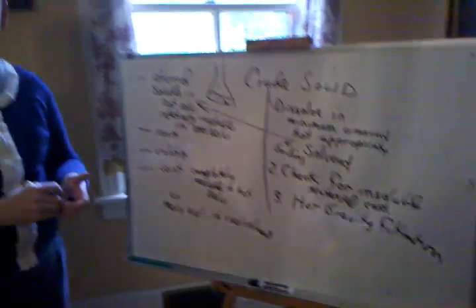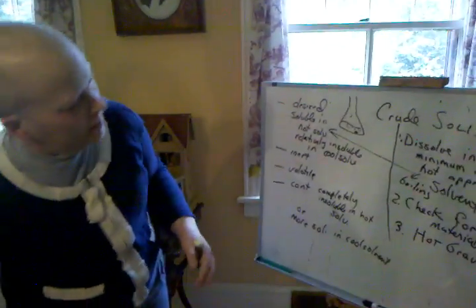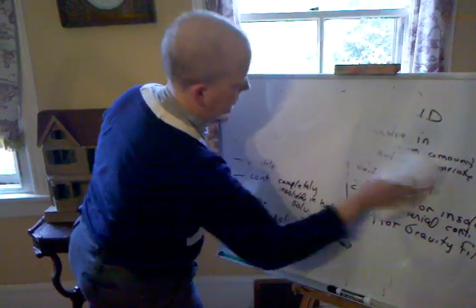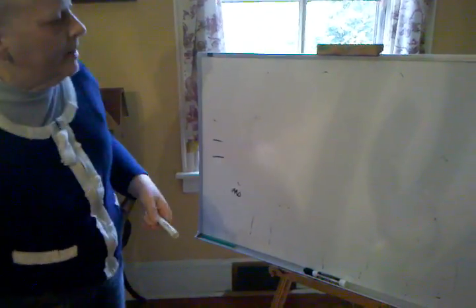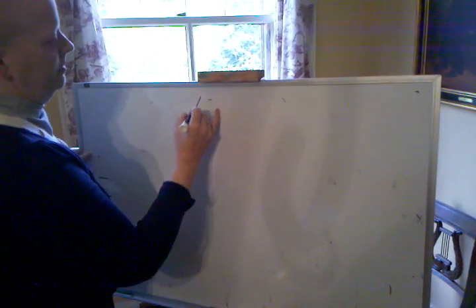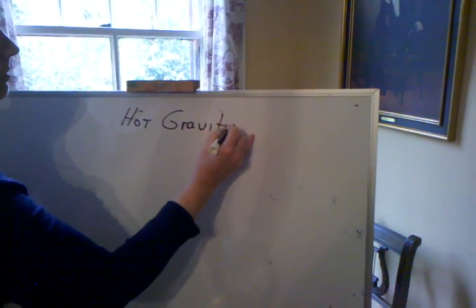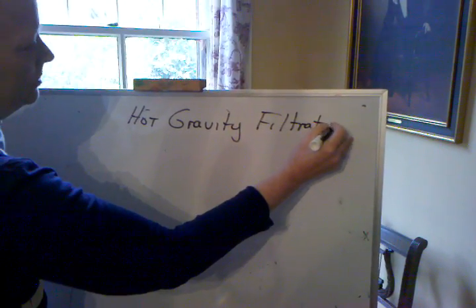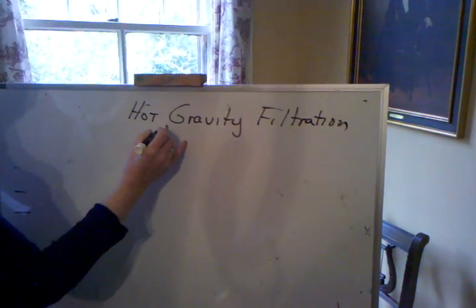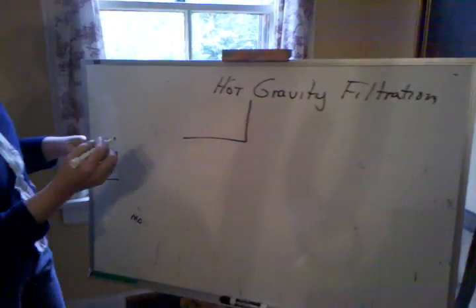Okay, hot gravity filtration. All right, what is a hot gravity filtration? Okay, so this is a flow chart of sorts here with a lot of information on it. Okay, hot gravity filtration: what you do is you use kind of a special setup.